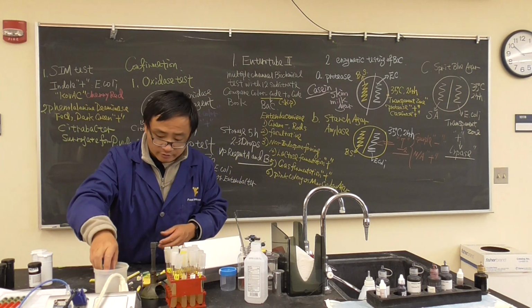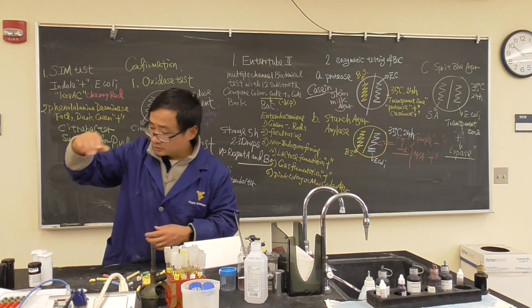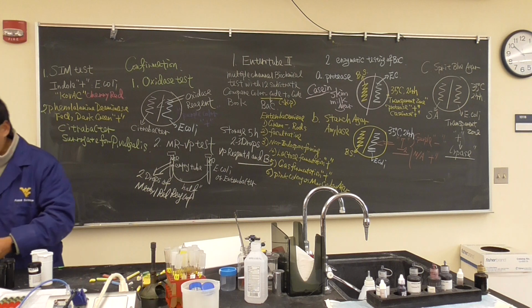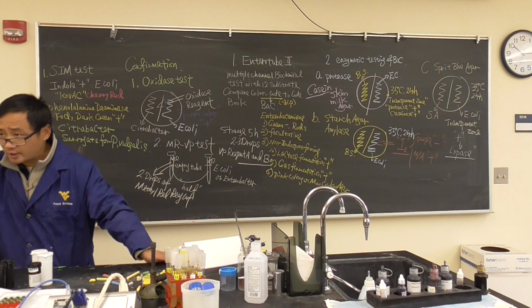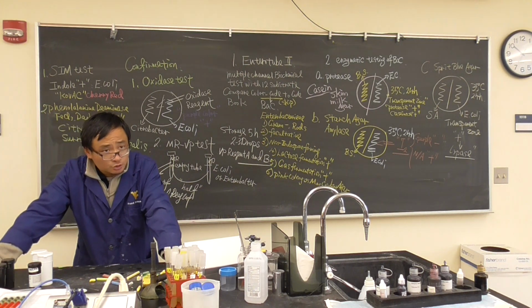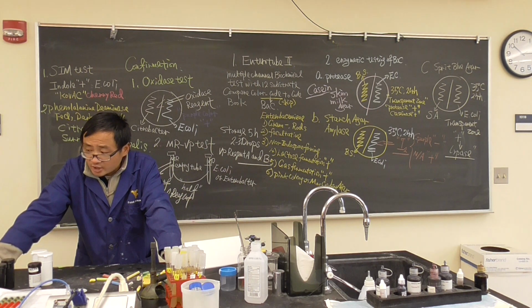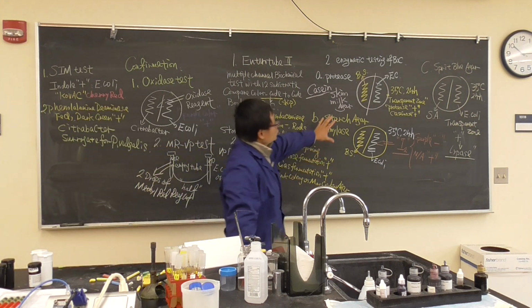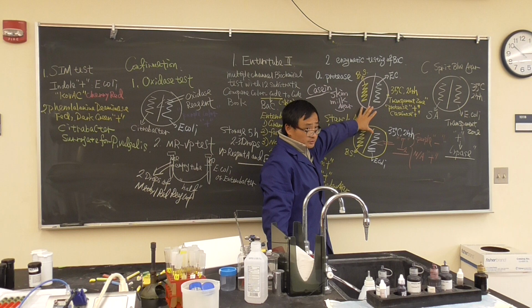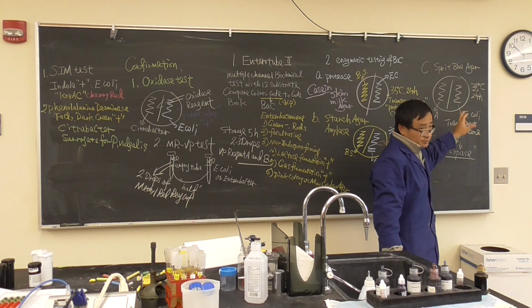So, Staphylococcus aureus, you can pick from these 2 tubes. I put them right here. And for the others, Bacillus subtilis is right here, and E. coli is right here. So today I give you a job to do, which is to arrange your work. We have a confirmation test, and we have these agar tests. So what do we do? Half of you do the confirmation test first, and half of you can do these 2 tests first. And then you find the time to do Staphylococcus aureus and E. coli on the spirit blue agar.